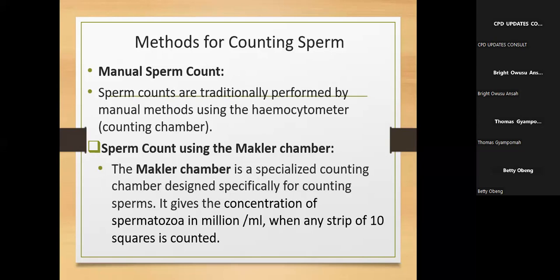Yes, Bright too has seen a Makler chamber before. Who else? I just want to know so that it becomes easier for me. So 2 out of the lot have seen a Makler counting chamber. Anyone else? Andy and Bright have seen or probably have used a Makler chamber before.